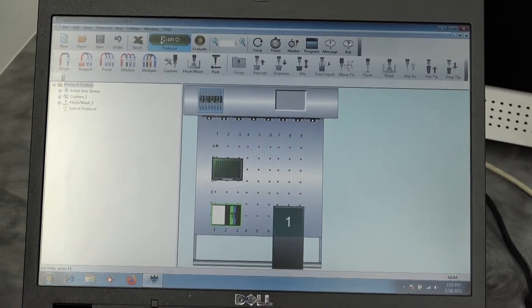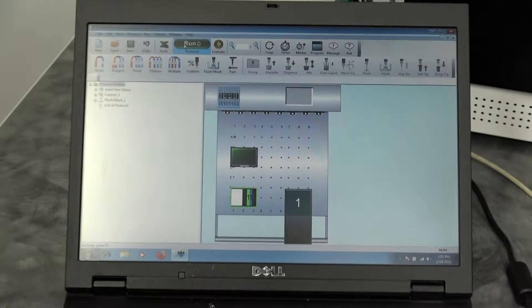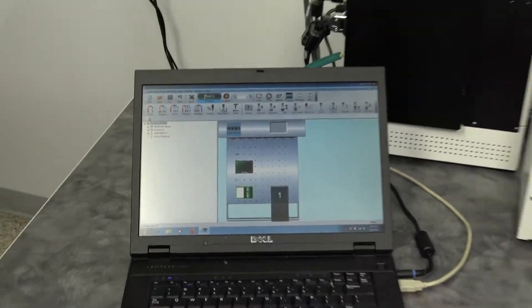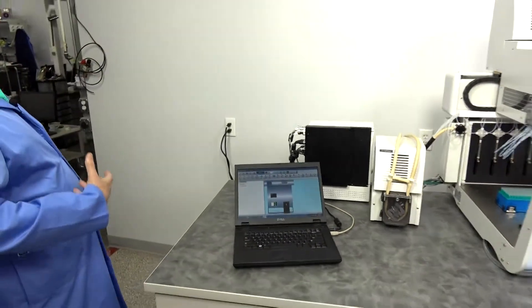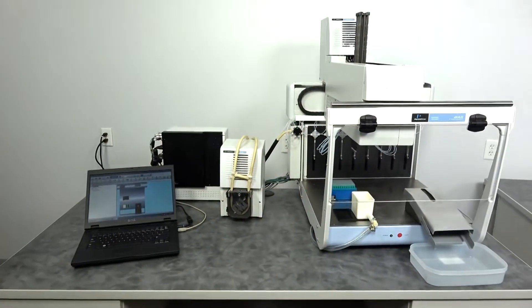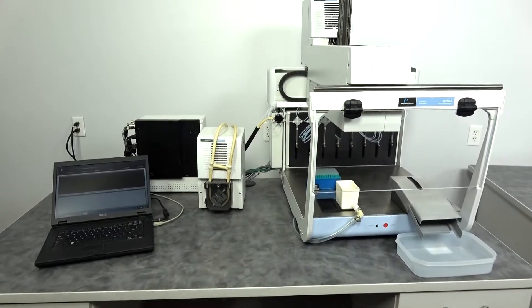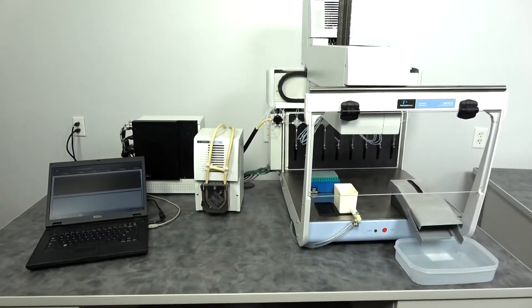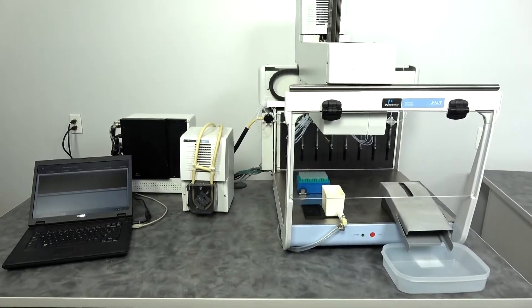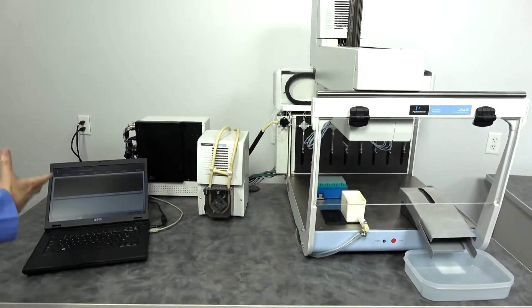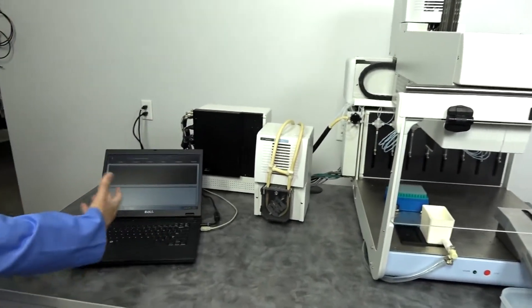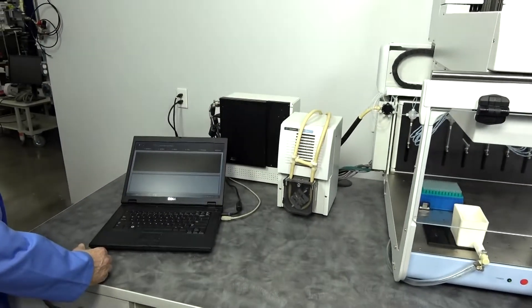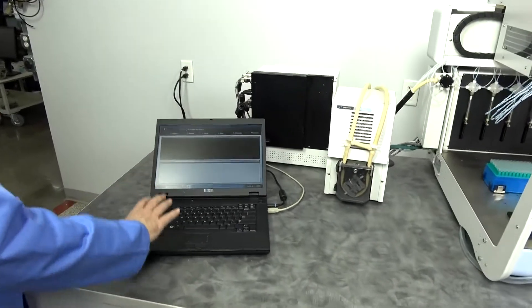It automatically generates a user interface for getting the protocol ready, both in gathering up the unit, running it, and cleaning up the entire unit.